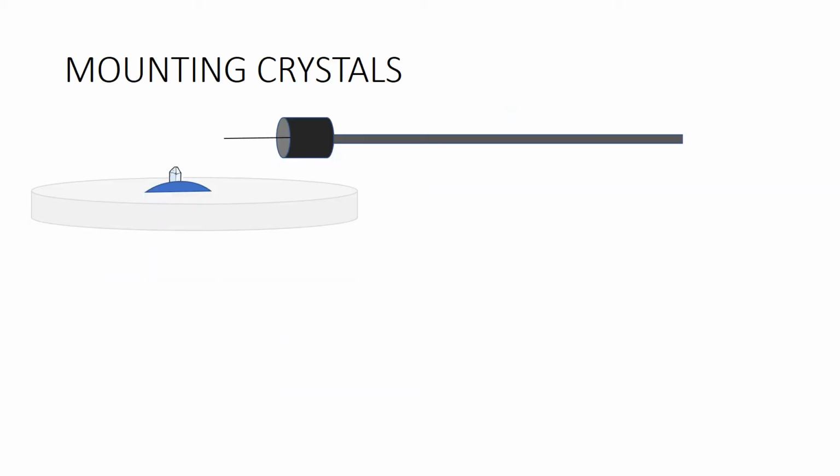Once you think you have a good crystal, you must prepare the crystal for the X-ray source. In order for the crystal to withstand the powerful effects of the X-rays being shot at it, the crystal is frozen with liquid nitrogen. This process also removes water from the sample, which can disrupt the diffraction pattern of the crystal if the ice is in the lattice of the crystal. By allowing the sample to be frozen, the sample can withstand the X-rays over a longer period of time.